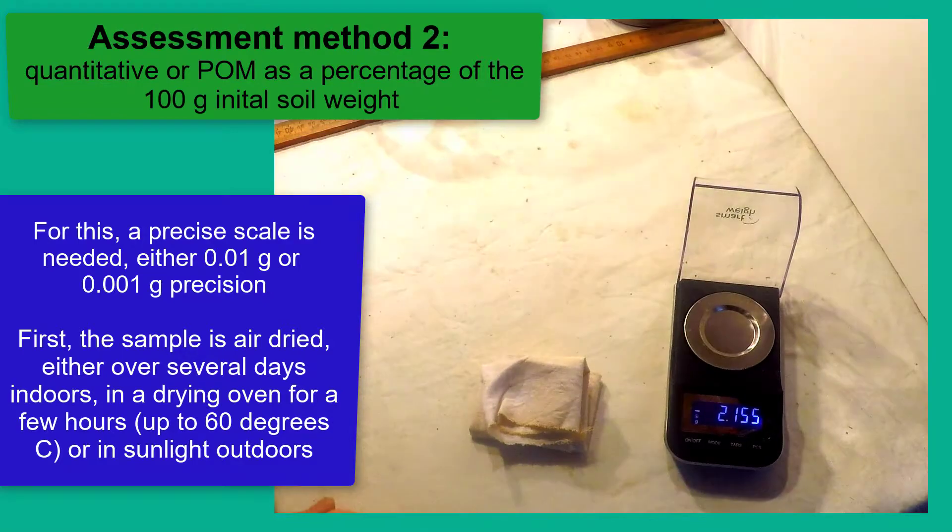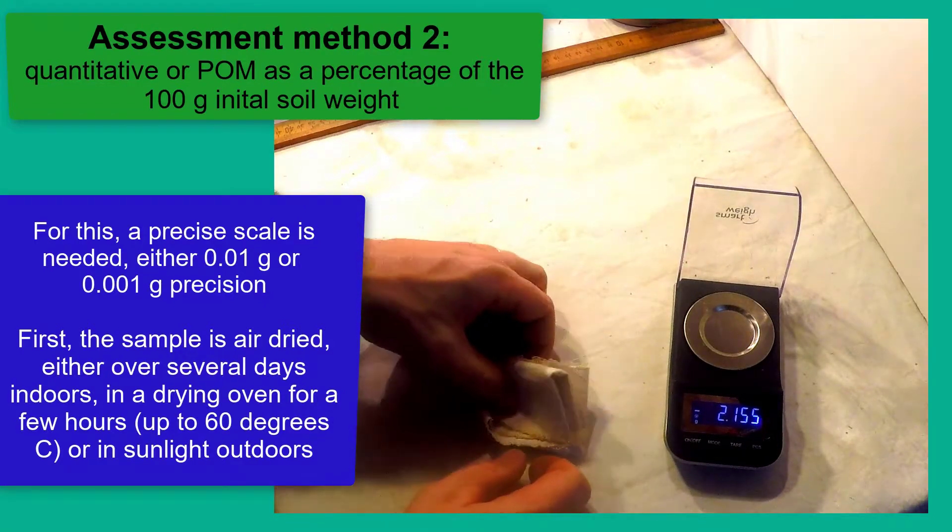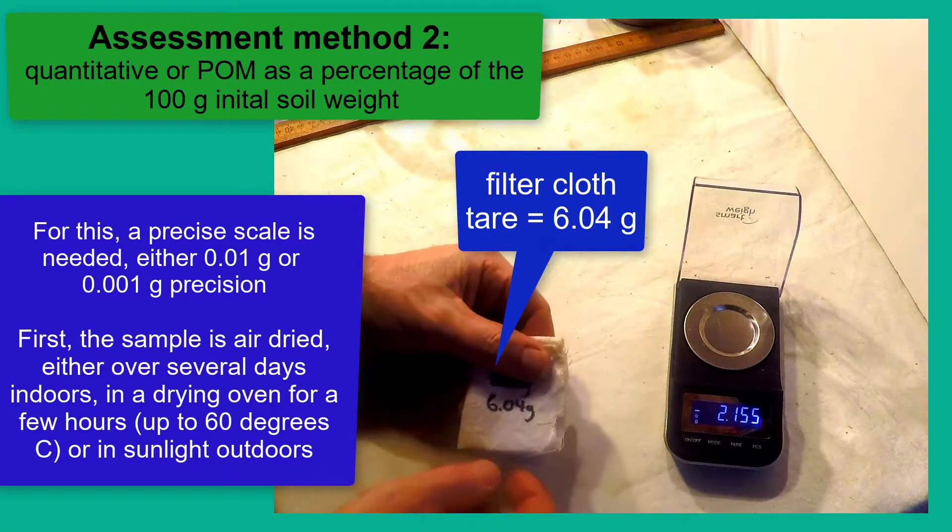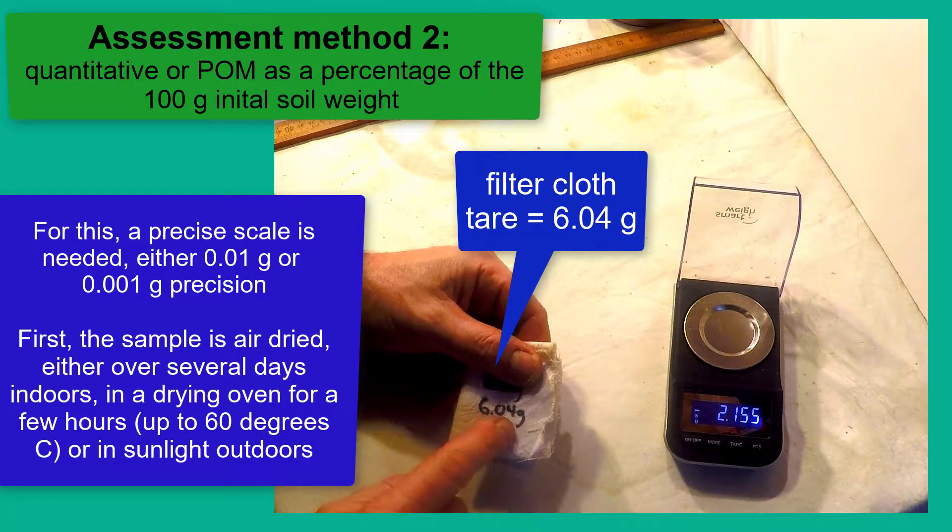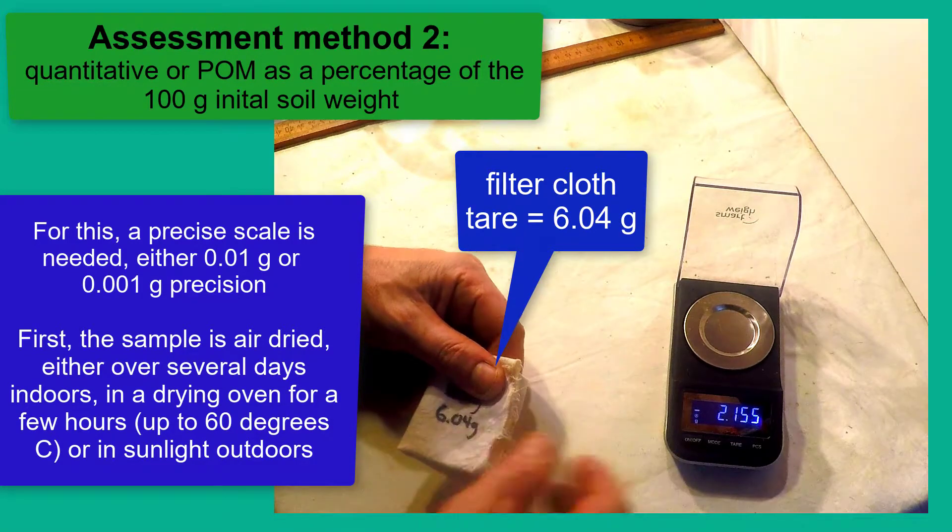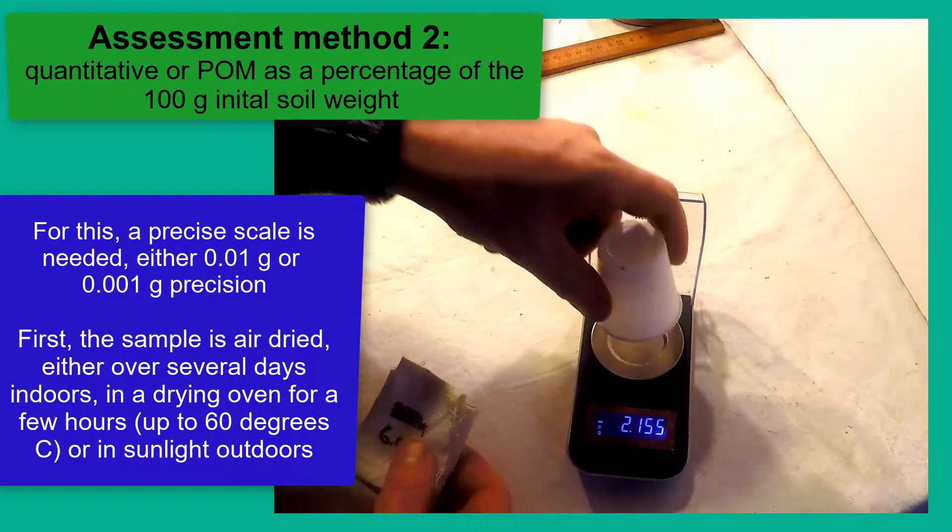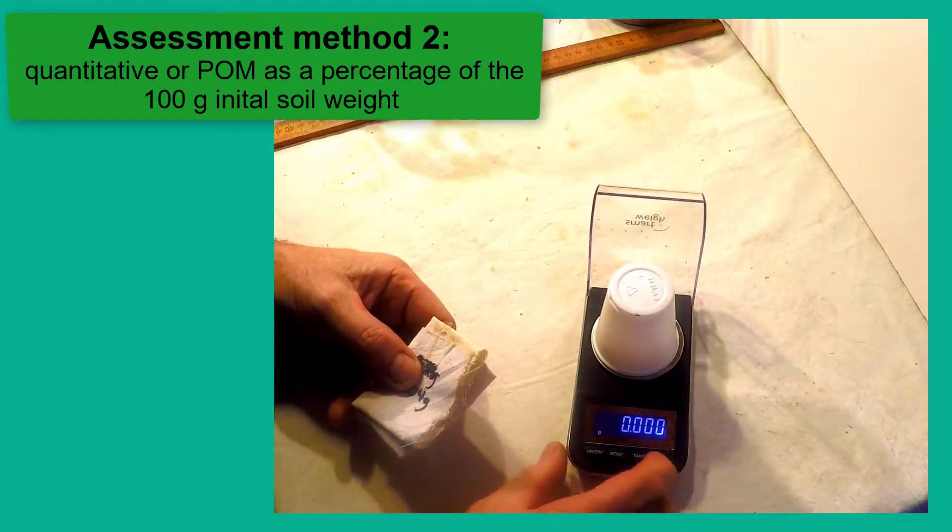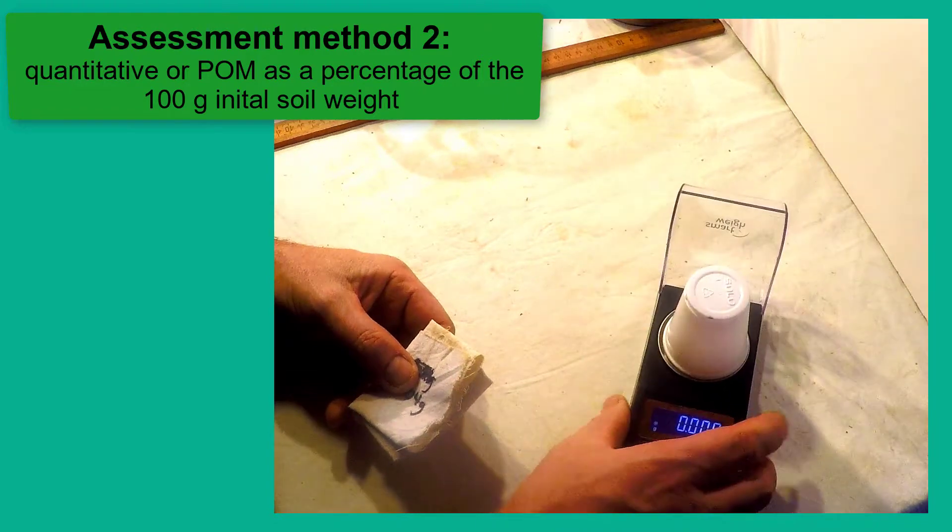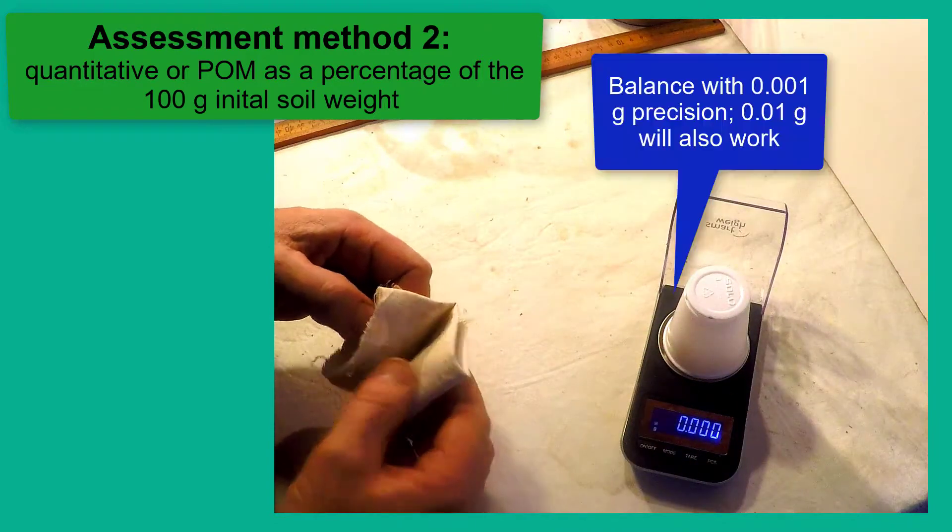If you have access to a precision balance with either one hundredth of a gram or one milligram precision, you can also dry the POM inside the cloth and weigh it. Since it is easy to dry POM in this way, it may be useful to dry and keep the sample in any case so that the POM can be weighed at some future point.